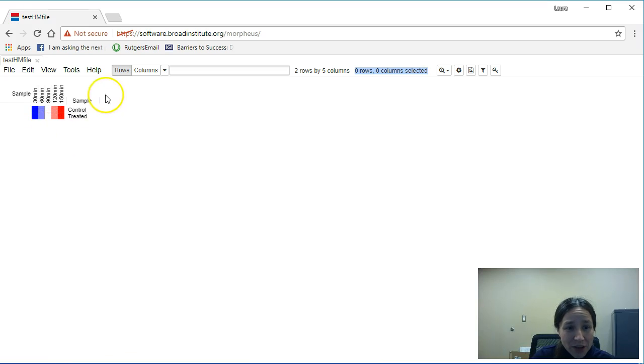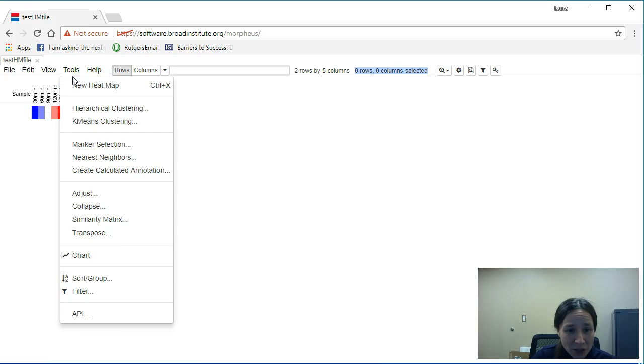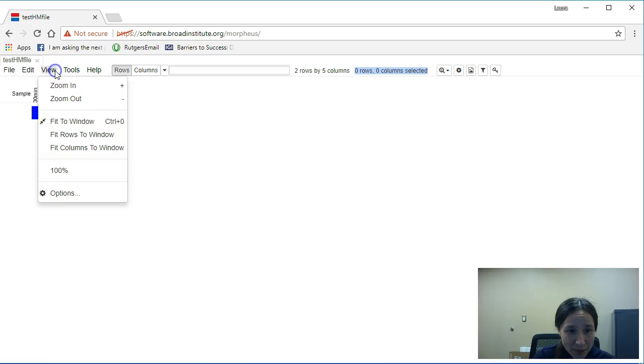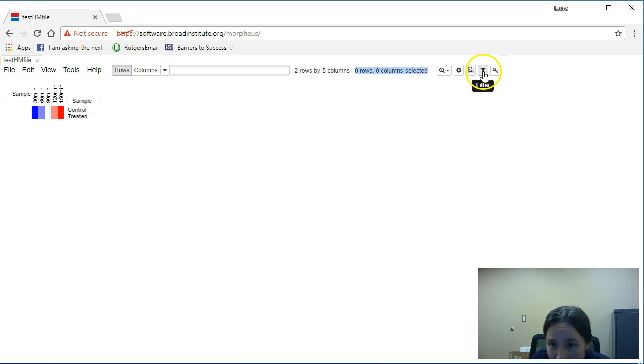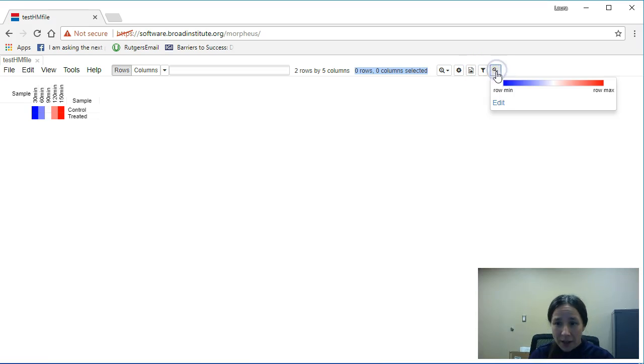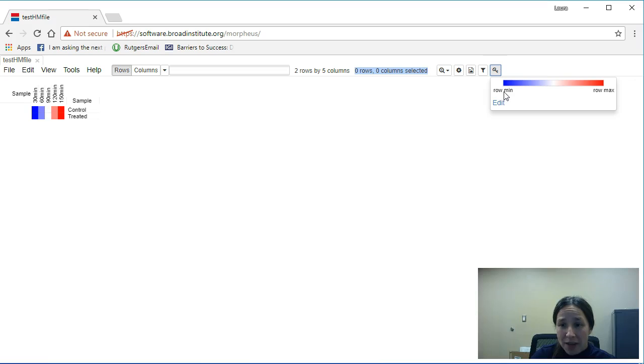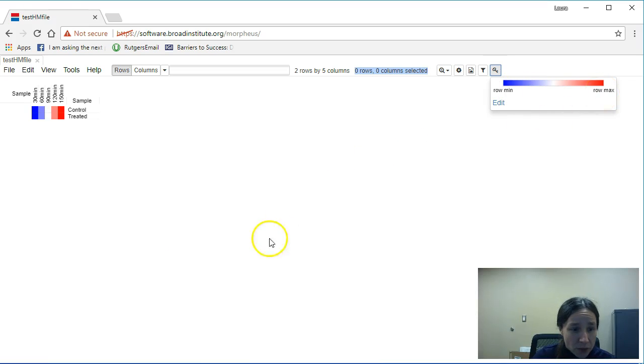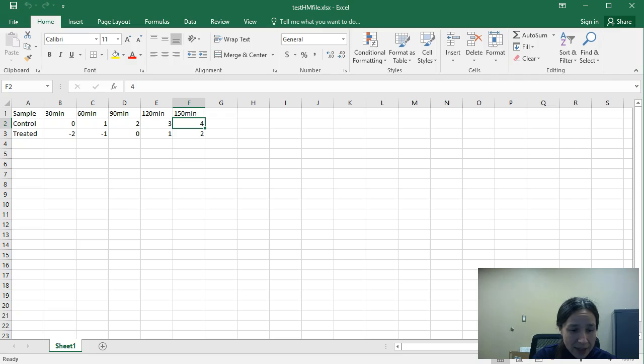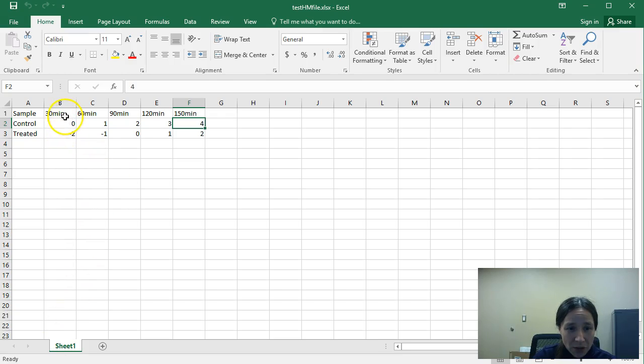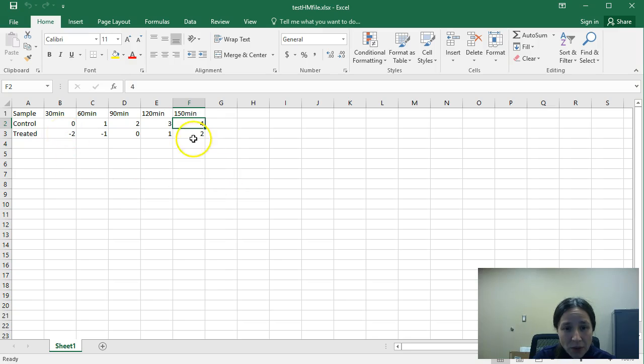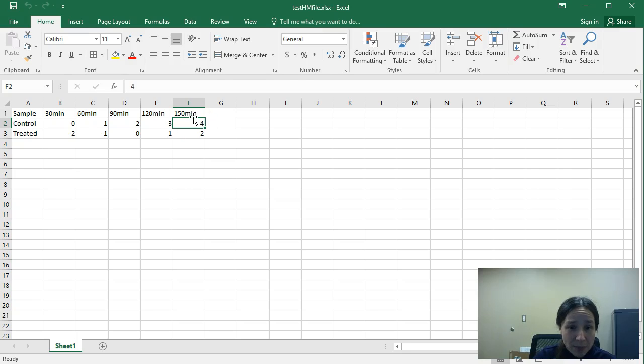Well this is because we are looking at relative values. So if we take a look at my color key, my blue represents my row minimum, and my red represents row maximum. So if we take a look again at our data, you'll notice that my lowest value is always in this 30 minute leftmost column, where my highest value is always in my 150 minute rightmost column.